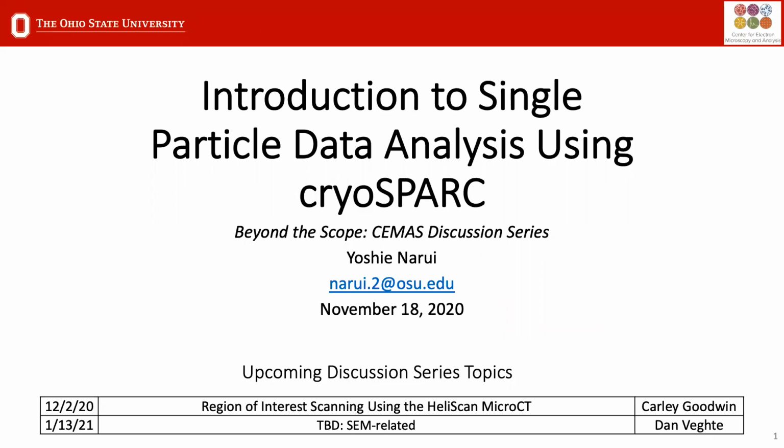Okay, so we have all these details about the data, and now we have to go back to CryoSPARC and actually import that. As I mentioned, the jobs are all located over here to the side. The first step would be to import the movies, so you would just select import movies. Here it gives you a bunch of information that you need to provide. The first is obviously the location of the movies. I'm already in the right folder, so I'm just going to tell it to look for the TIFF files. I just selected all the TIFFs that were in that folder.